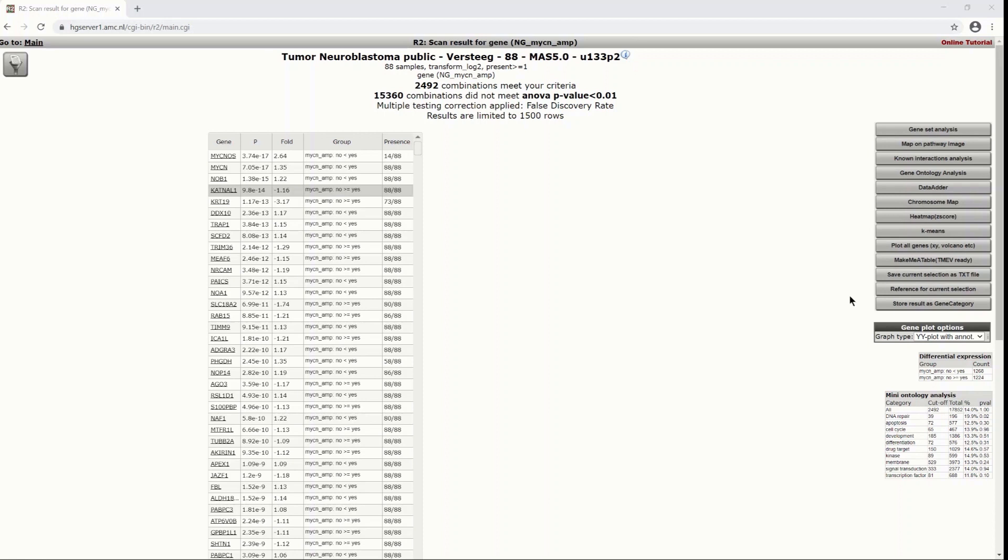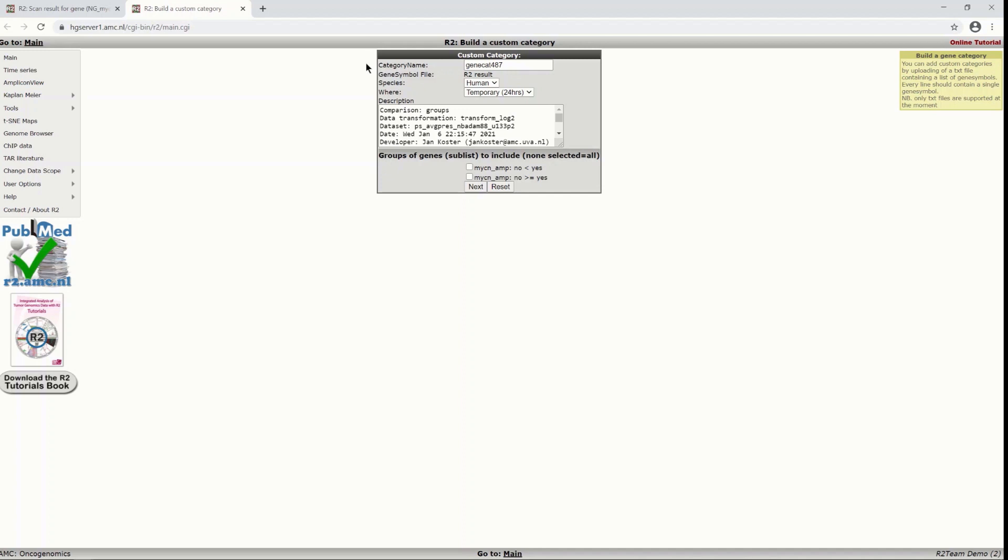The only thing that I will show right now is how to store this information. One option is to store your result as a gene category. That means that you can store it in R2 to use in different analysis later on. So if you click on store as a gene category, which just means as a gene set, you will be asked to put in a category name.